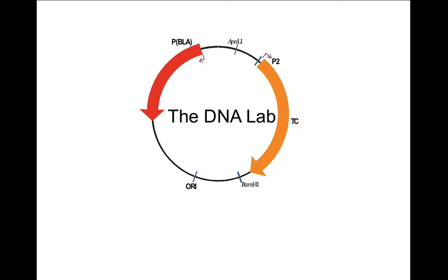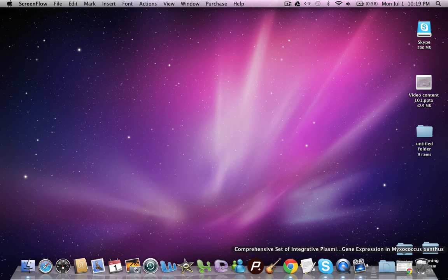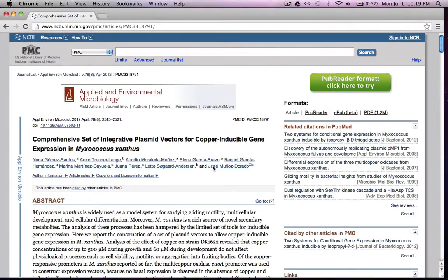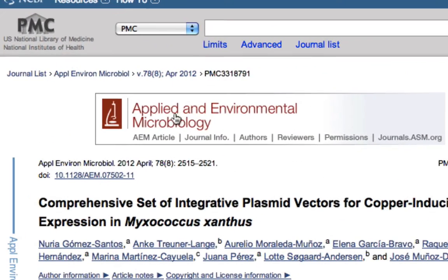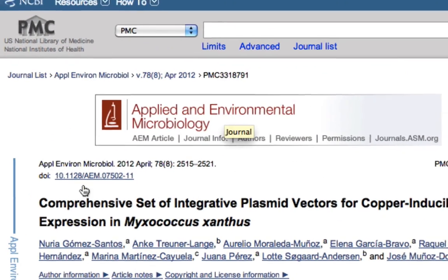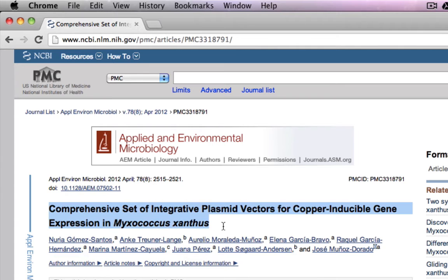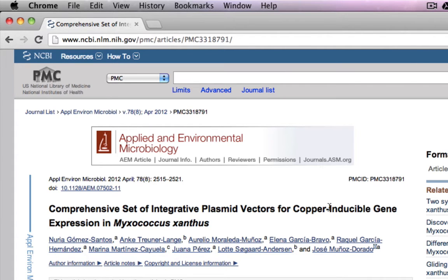Obviously you would look for an expression vector which works in this bacteria Myxococcus xanthus, and you bump into this paper in Applied and Environmental Microbiology. It says that authors created a comprehensive set of integrative plasmids which have copper inducible gene expression for Myxococcus xanthus, and this is what you are looking for.